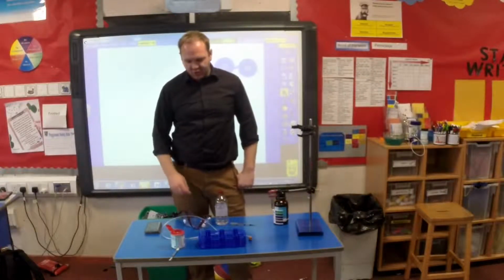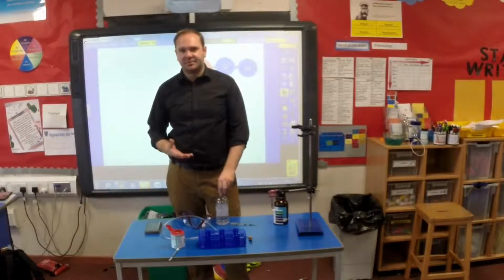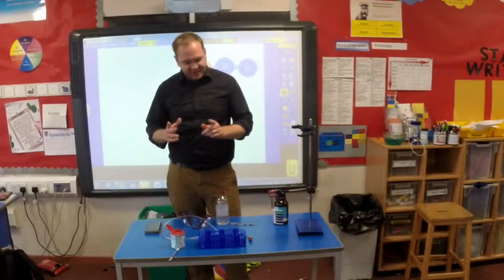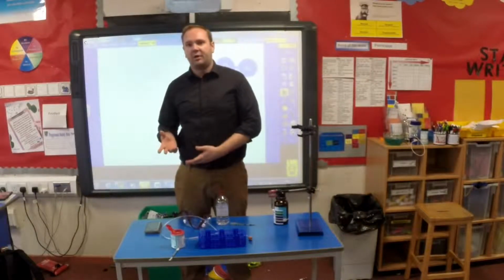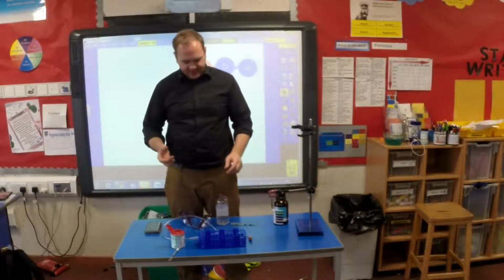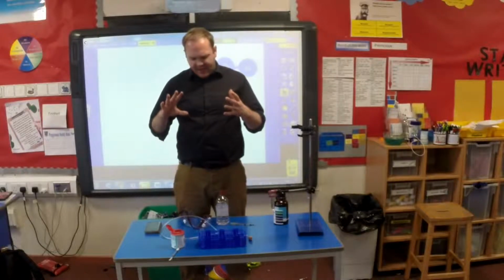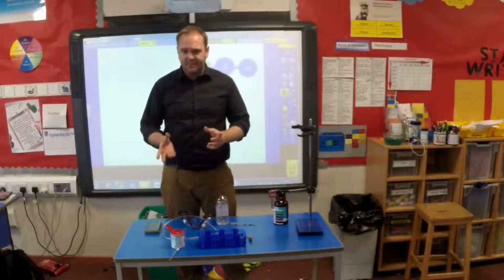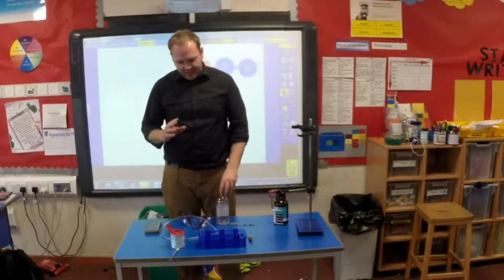Guys, in this video we're going to be exploring a chemical reaction with an environmental message behind it. This is to do with acids and bases, and I usually do it following on from the acid and base neutralization experiment. So if you haven't watched that video, go back and watch it, because a lot of the processes and theory behind it tie into that last video and were first discussed there.